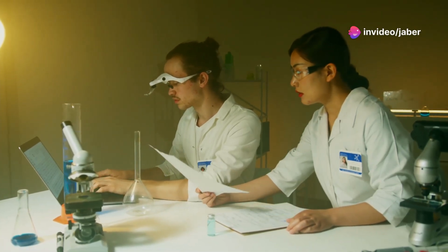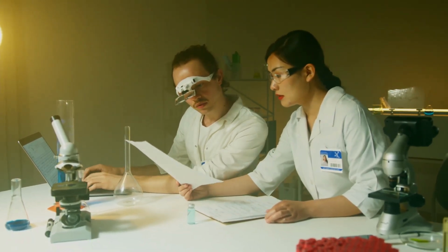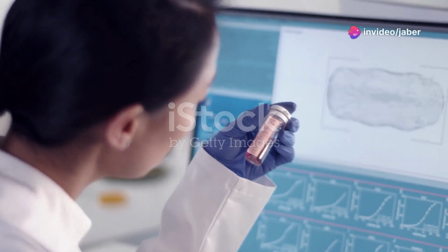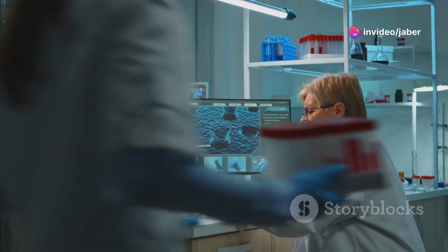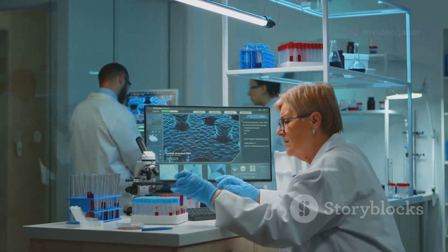Now, while RNA Seq generates a treasure trove of data, it's not as simple as just reading the results off a screen. Raw RNA Seq data can be like a jumbled jigsaw puzzle with pieces of varying sizes and shapes. That's where normalization comes in, acting as the puzzle master that helps us make sense of it all.